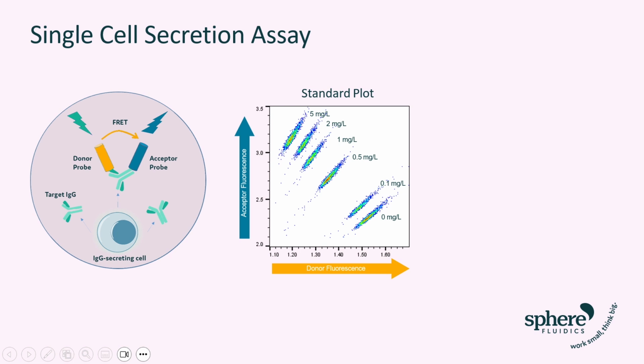As you can expect, if a picodroplet contains a high amount of a target molecule, it will appear at the top left corner of the scatter plot, corresponding to an increase in FRET acceptor intensity and a decrease in donor fluorescent intensity, whereas the negatives will naturally appear at the bottom right on the scatter plot. So based on their location on the scatter plot, you will be able to judge the abundance of the target molecule inside those picodroplet populations.